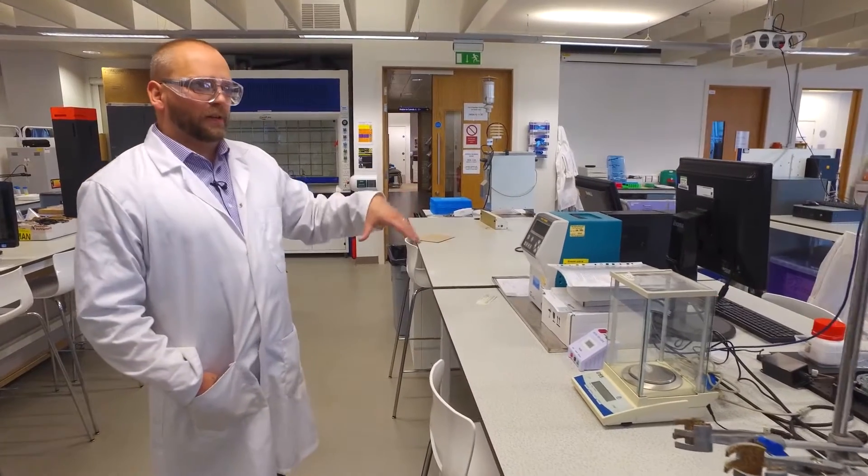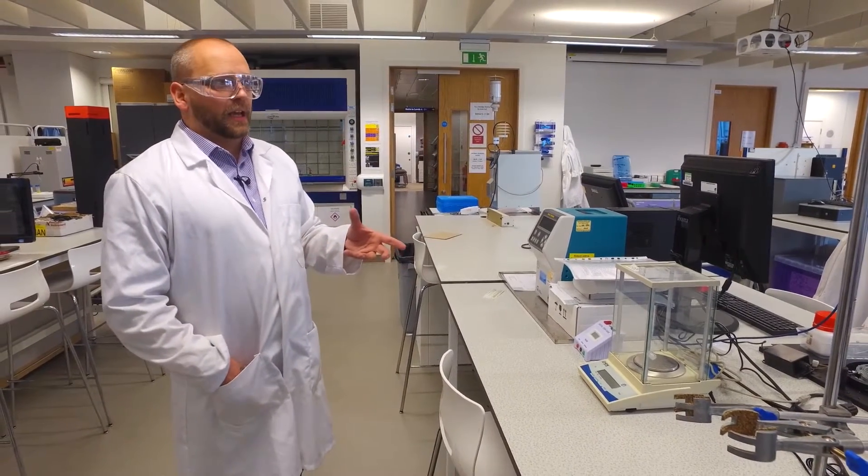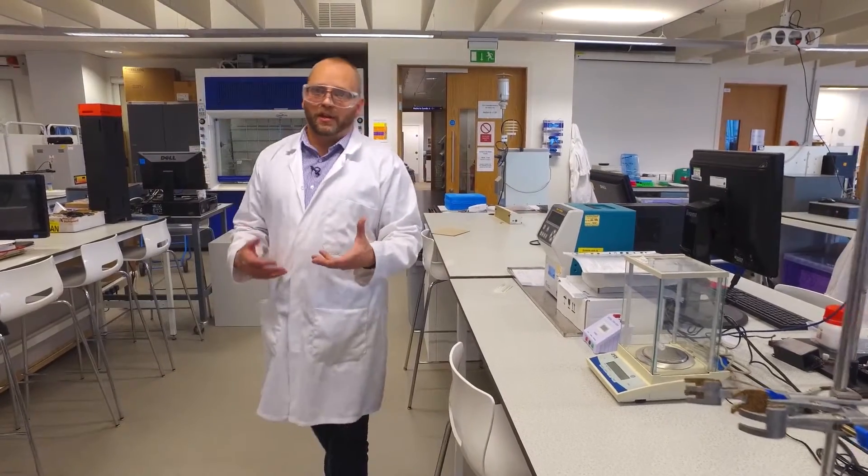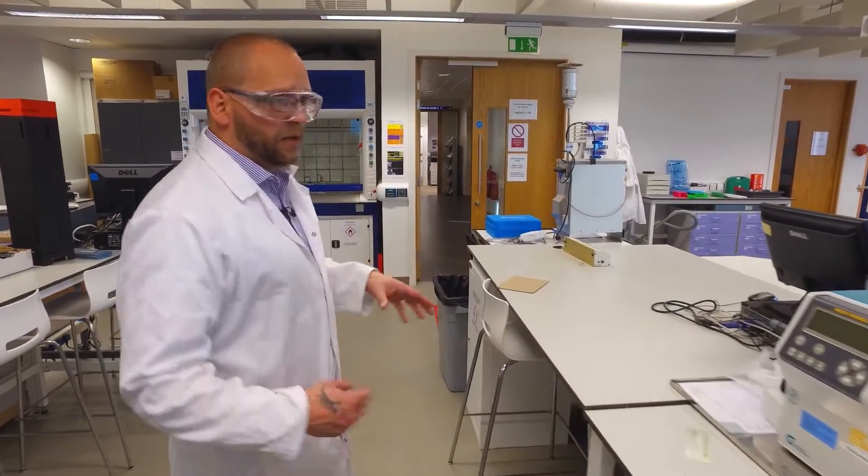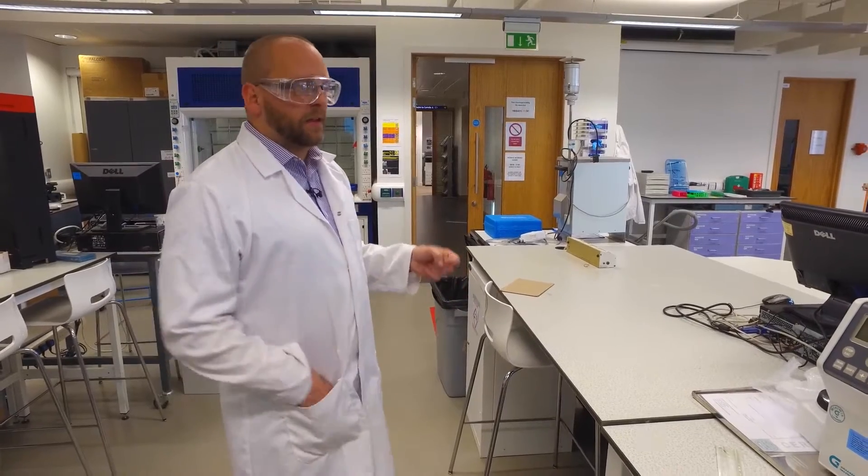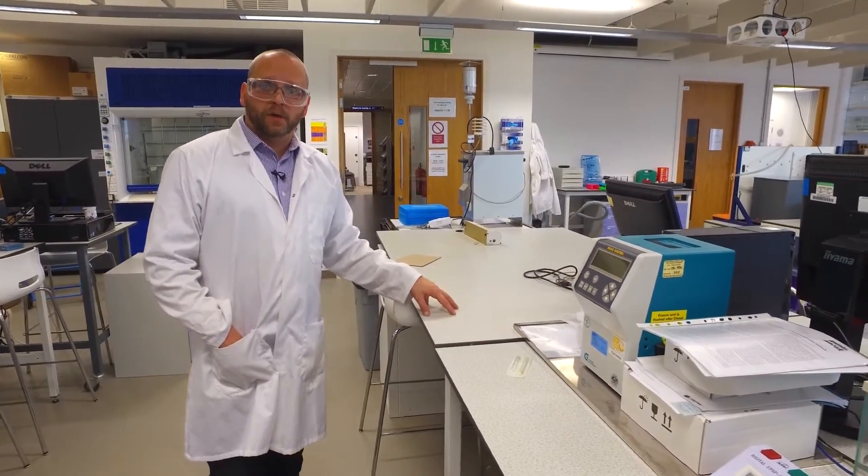What we've got here in this lab, what initially would appear as a student laboratory where you're doing some initial experiments, really becomes a central analytical capability within which you'll be supported in your research work.